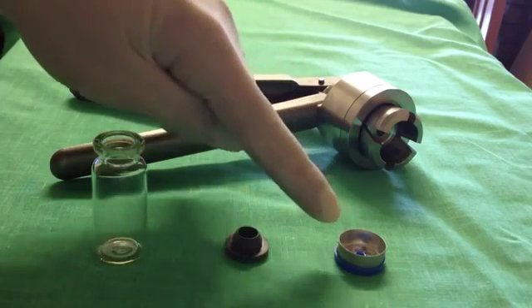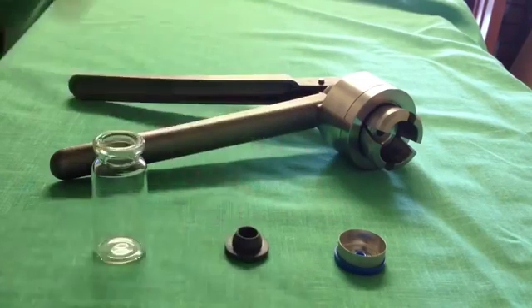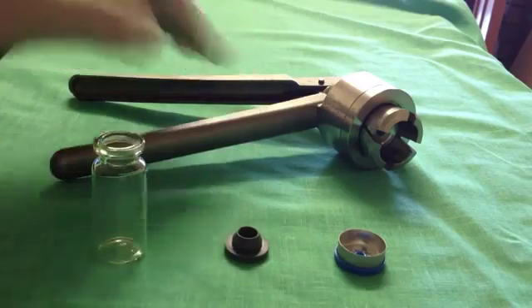What we have here is the actual cap, the rubber stop, the vial, and the crimper.